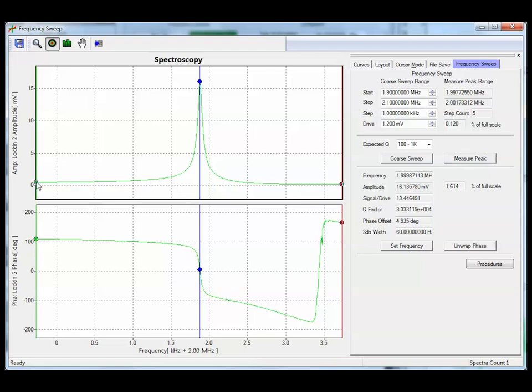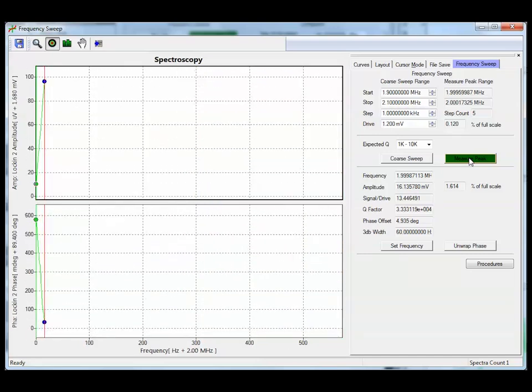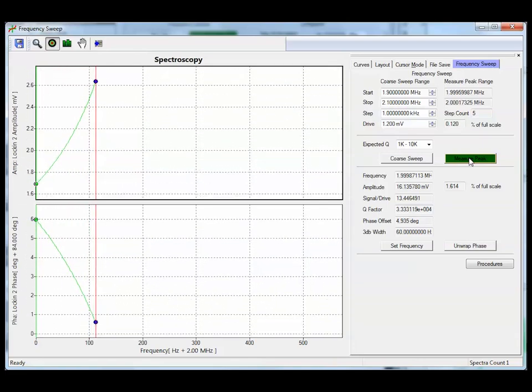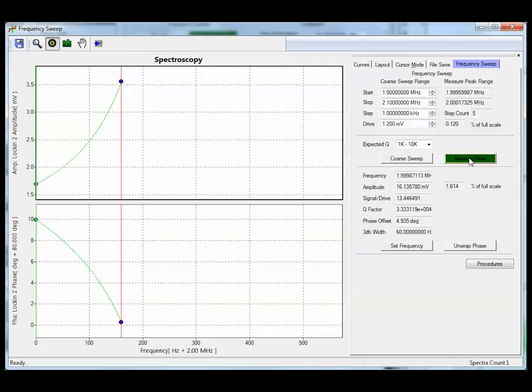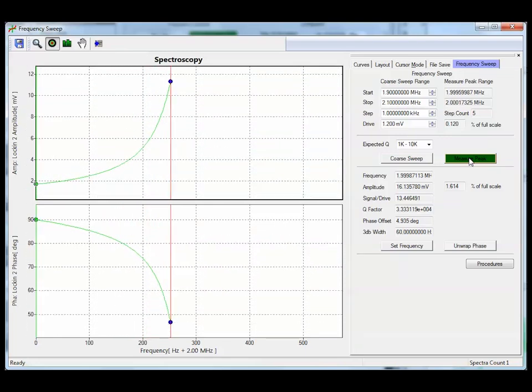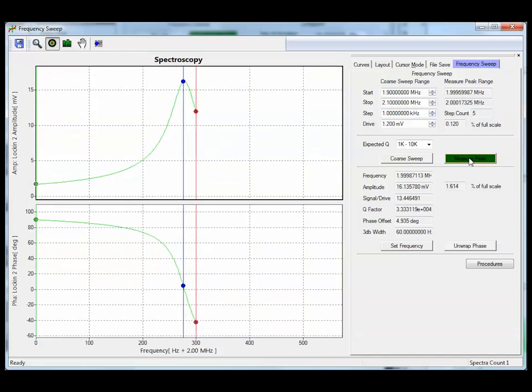I think we should zoom in a second time, just from here to here, which would make the phase wrap disappear. And now we can go one step higher in the Q factors. And here's our peak. This looks pretty good.